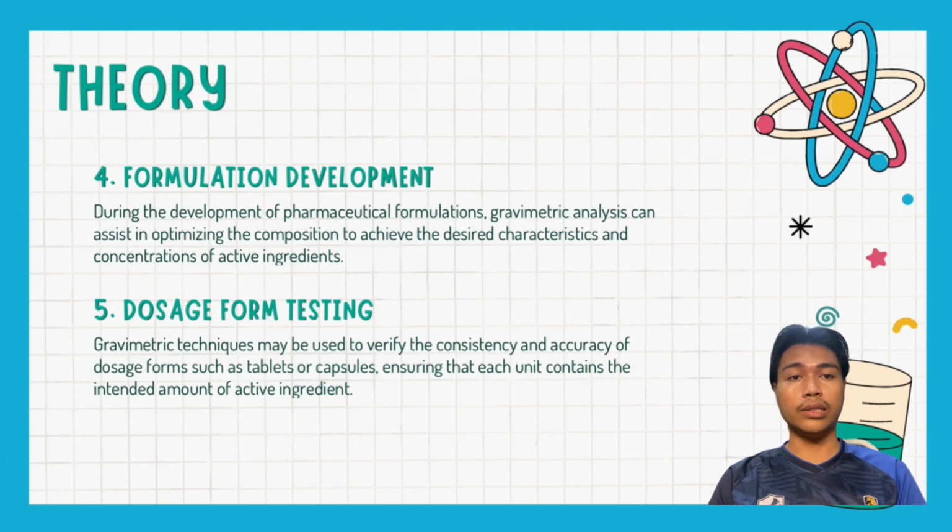And lastly, dosage form testing. Gravimetric techniques may be used to verify the consistency and accuracy of dosage forms such as tablets or capsules, ensuring that each unit contains the intended amount of active ingredient.